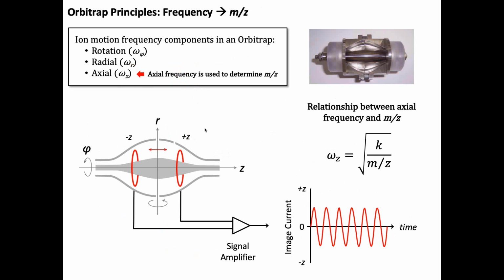It's a destructive technique. The Orbitrap, however, comes in, and it starts to rotate, okay? And so you've got that minus Z and plus Z, which are basically a detector plate, if you will. And these guys measure what's called the image current. So this red packet moves back and forth, very, very fast, to generate this sinusoidal curve, where the image current is generated for the frequency. So you're measuring the ion's frequency. Everything that has a distinct mass to charge has its own frequency. So you're not measuring mass to charge, you're measuring frequency.